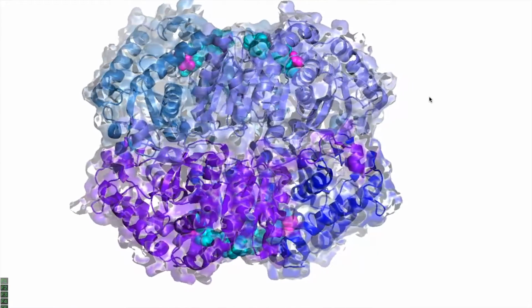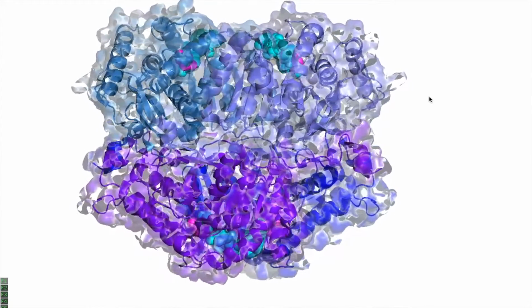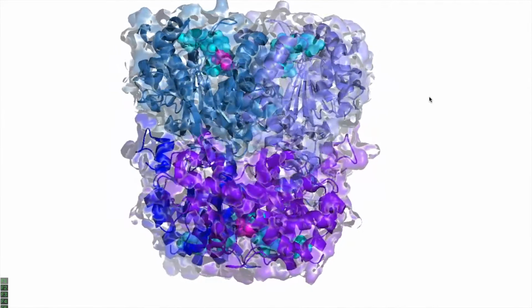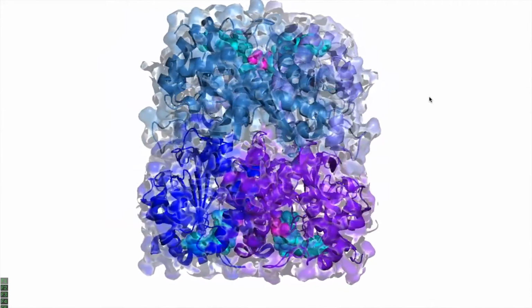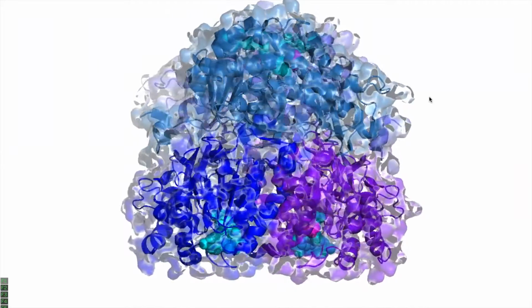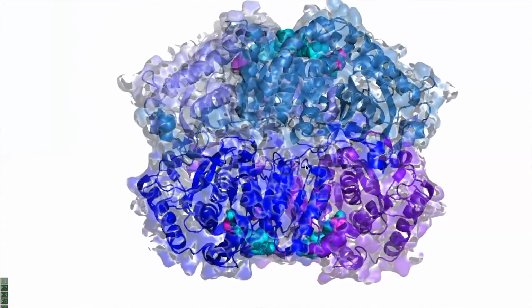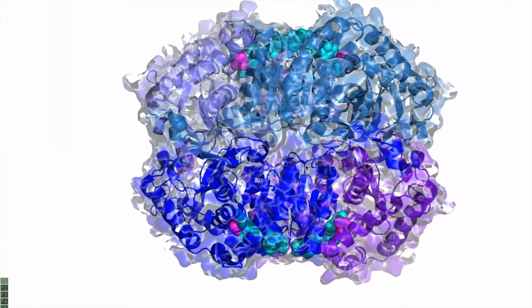So this is the enzyme that I've been studying, lactate dehydrogenase, and this is the 3D space that it occupies. As you can see, it has a tetrameric structure. This means that it has 4 subunits which are depicted in different shades of blue and purple cartoon here. This also means that it has multiple active sites which can catalyze reactions.